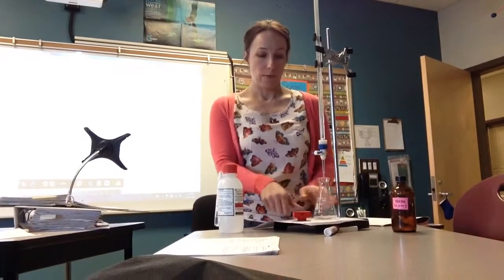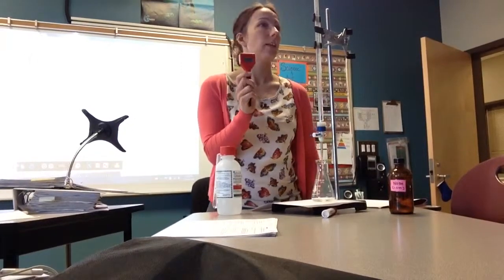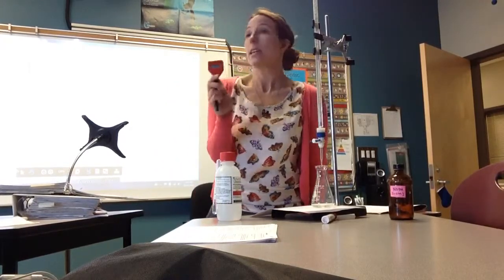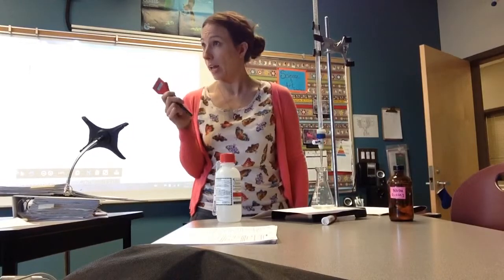In here I have my hydrochloric acid. If I were to stick this pH meter, so this is a pH meter, turn it on, they never ever work. You always have to calibrate them. They take forever to calibrate. I don't like using them. But it's like a digital thermometer. You stick it in and it gives you a number, and the number is your pH.